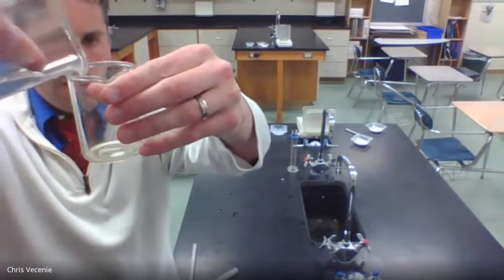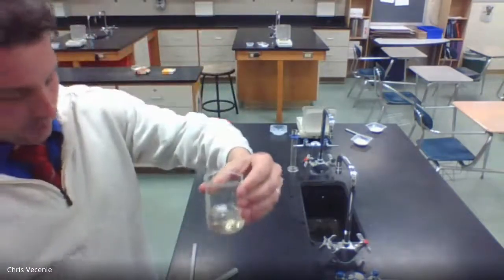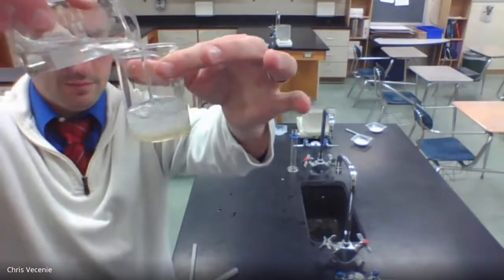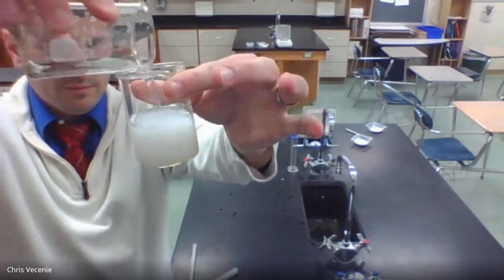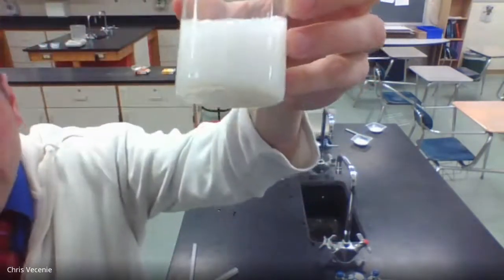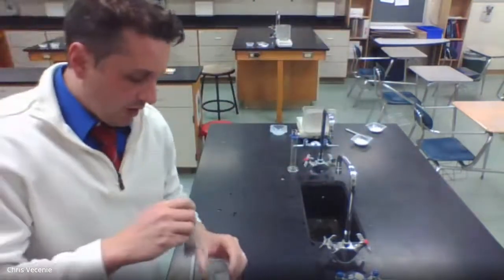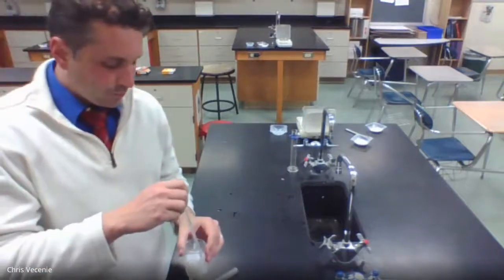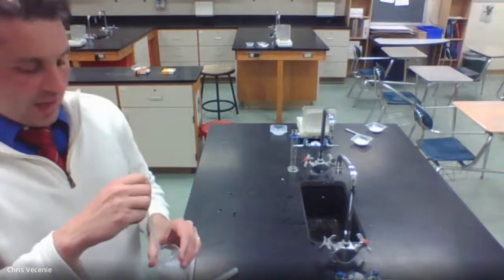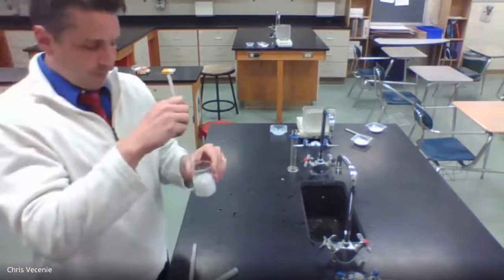And so nothing crazy happening there. I just dumped that over. But when I pour this one, it should initiate the reaction. Okay, and sure enough, you guys are seeing that is absolutely not the same as it used to be. All right, so I'm going to stir this. And all I'm doing here is making sure I'm giving the calcium chloride time to react with the sodium carbonate. All right, so I'm going to stir.